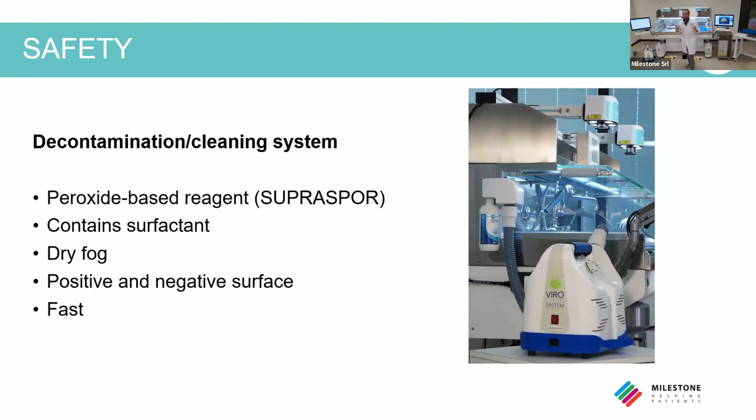I told you positive and negative surfaces. Why? Because, let me show you, we do have some modules. So this is just a perforated shelf for holding the buckets. So we do have a positive surface and then a negative surface that, of course, must be clean too.